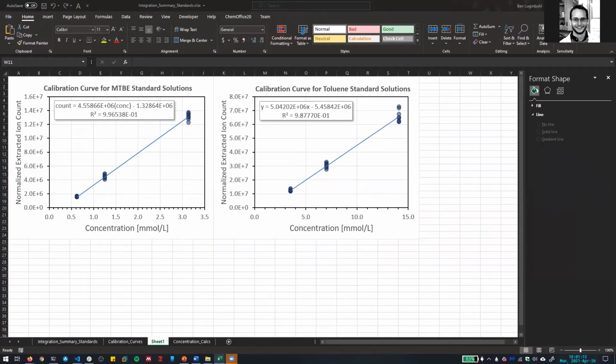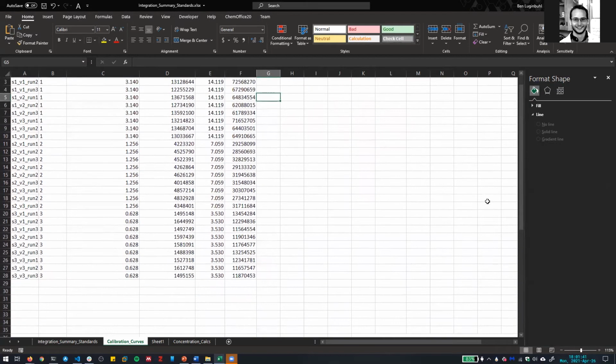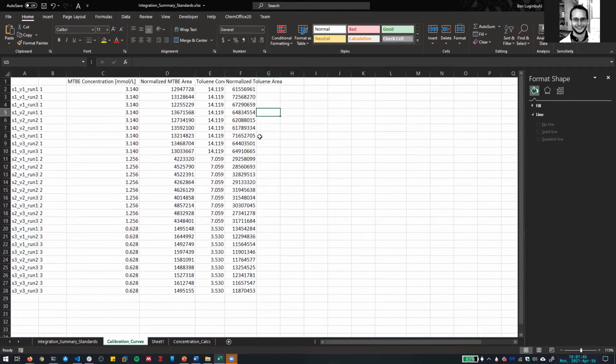Alrighty. I know it's not quite 10 minutes yet, but is everybody ready to move on? Also, has anybody been paying attention to what I've been doing in the sheet here, making it so that everything gets automatically filled in? Ready to move on, guys? Okay. Of course, if you run into problems later when you're processing this on your own, you can always ping me on Slack and I'm happy to help.